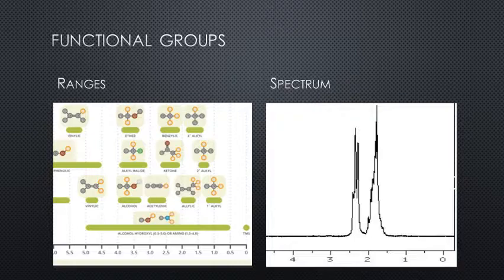Now this just shows a couple of zoomed in spots for our functional groups, just to make them a little easier to see. So we put in our second environment, which was at about 1.8 parts per million. Then we have our second group, which was at about 2.4 parts per million. You'll see that the first group passes through the alcohols, the allylics, and the alkyl groups, while our second passes through the alcohols as well, our ketones and our benzylics.